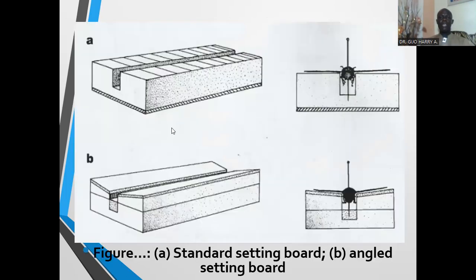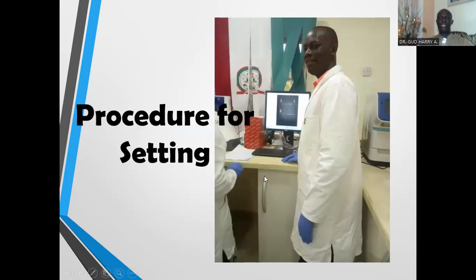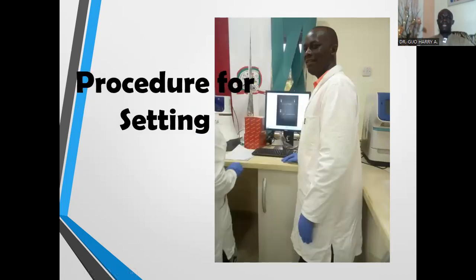Now, here are the setting boards. This is the standard setting board that's flat, while the angled setting board is a little bit tilted, and both are used for the preservation of insects whose wings are expected to be spread for proper identification.